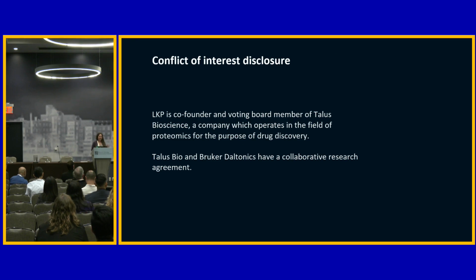As my conflict of interest, I'm a CTO at a startup company that I've co-founded. We run our two-instrument mass spectrometry closet as a core facility, within our internal programs, balancing that to fund our internal programs with these external programs, and figuring out how we draw customers that will help pay for these instruments that are incredibly expensive.